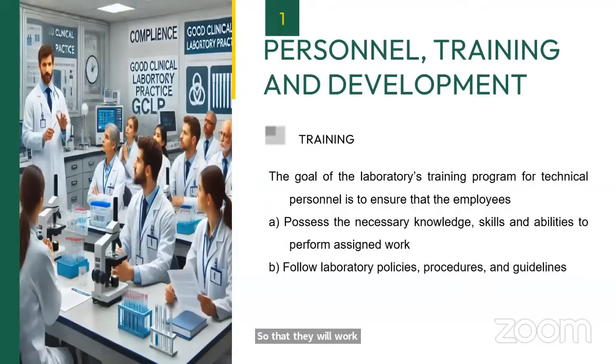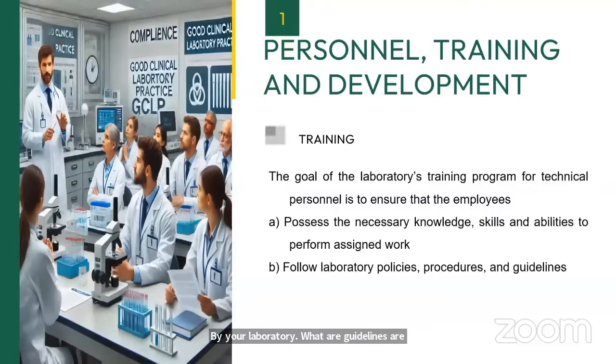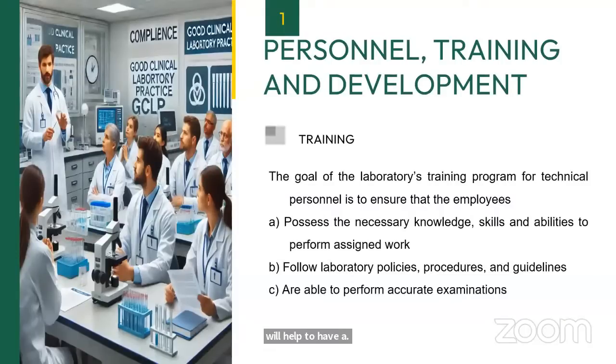The training also should be given to follow the laboratory policies, procedures, and guidelines. Whatever policies and procedures have been laid down by your laboratory, and whatever guidelines are available, such as good clinical laboratory practices, biomedical waste guidelines, and certain other guidelines such as the NACO guidelines, your laboratory staff should be trained in those guidelines so that they will follow them, and ultimately it will help to have proper services given by your laboratory.